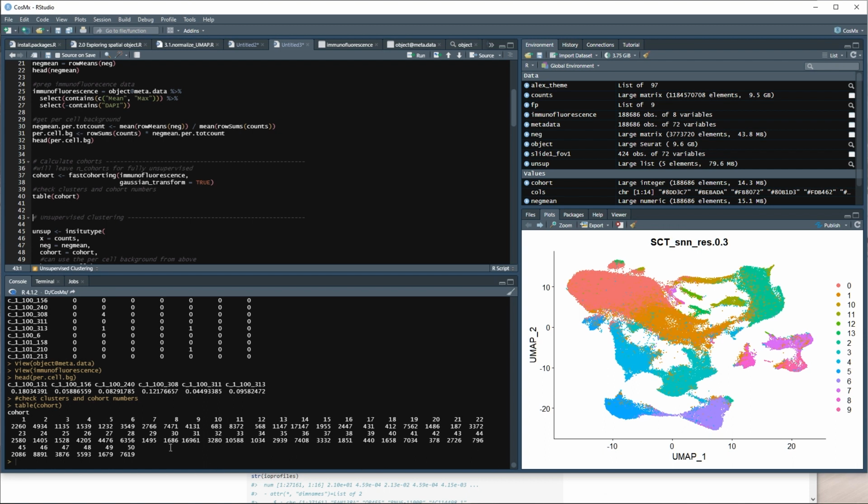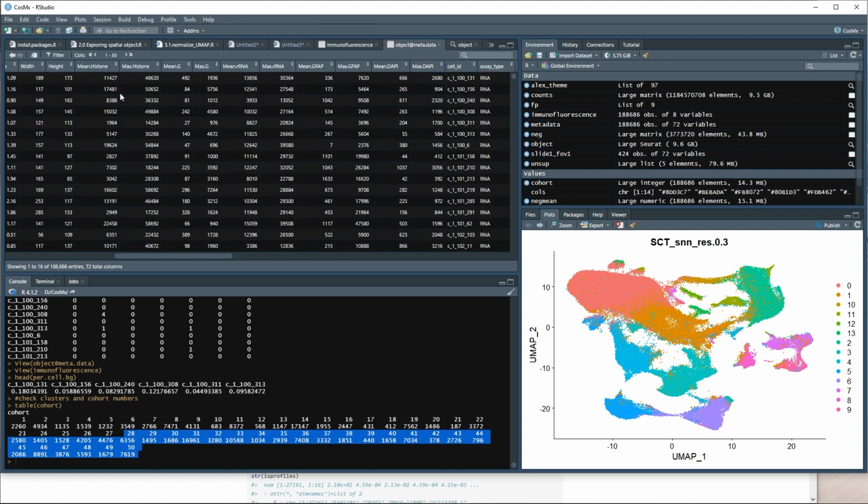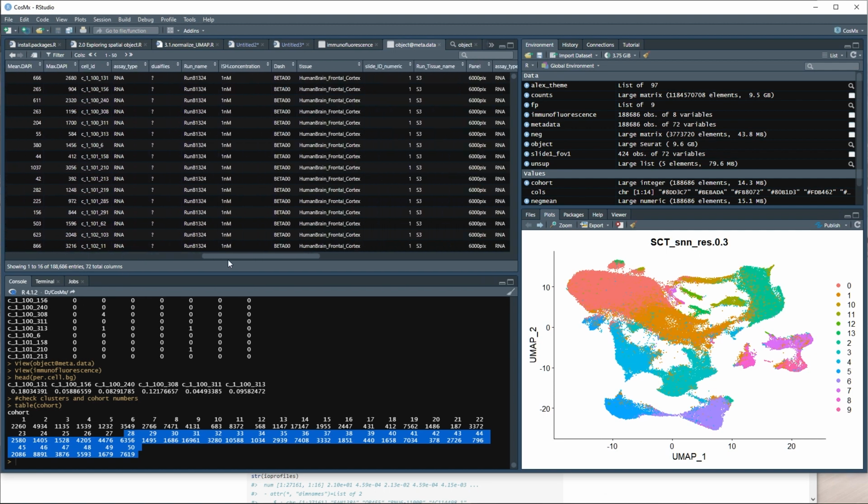Another thing is that all of our samples, I'm not 100% sure where they all came from, if they were picked specifically by a pathologist to be the same, but remember there's a lot of samples too. So depending on where all of our samples come from, this might be one type of tissue, 1 through 17, 18 through, I don't know, 27 might be another type of tissue, and then 28 through 50 might be another tissue type. We just don't know where exactly they all came from. Even if we look at the metadata, I don't believe this is awfully informative.